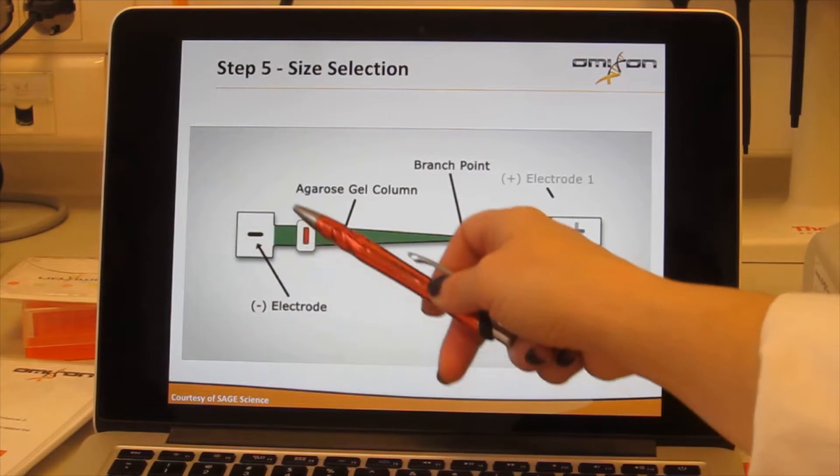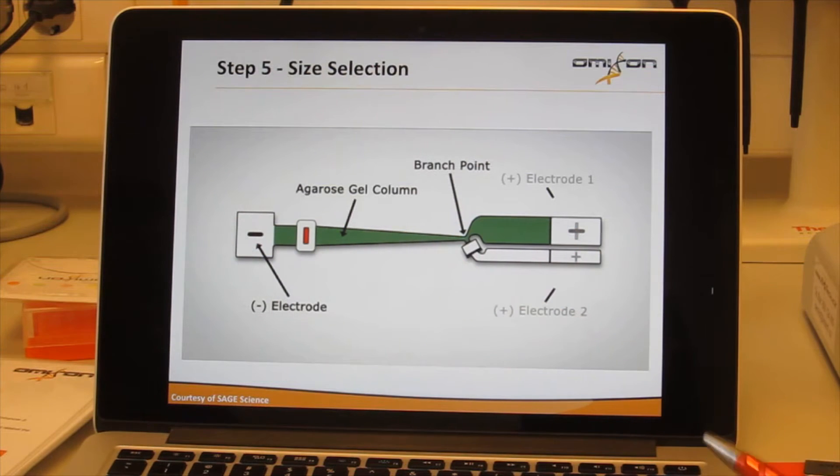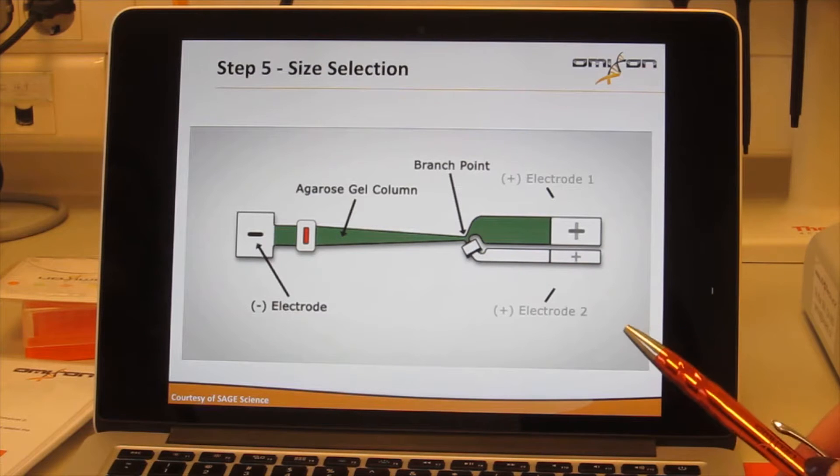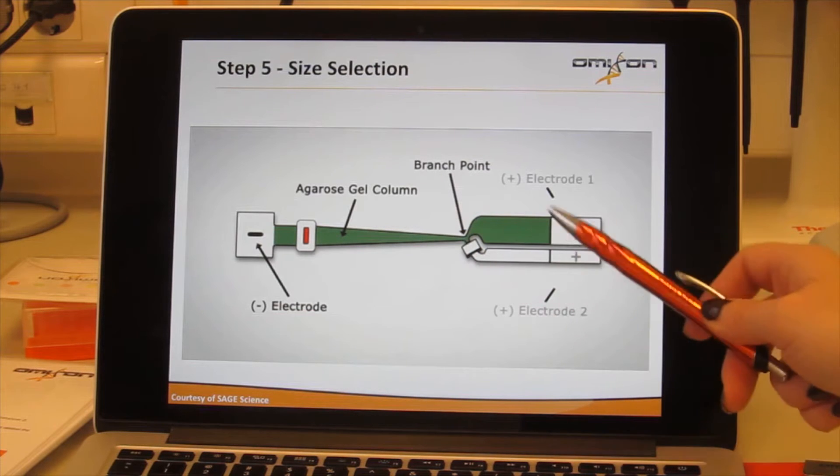There is a port for the negative electrode on one side and two ports for positive electrodes on the other side. Note how on one of the branches there is no agarose gel. Only on the top one there is one.